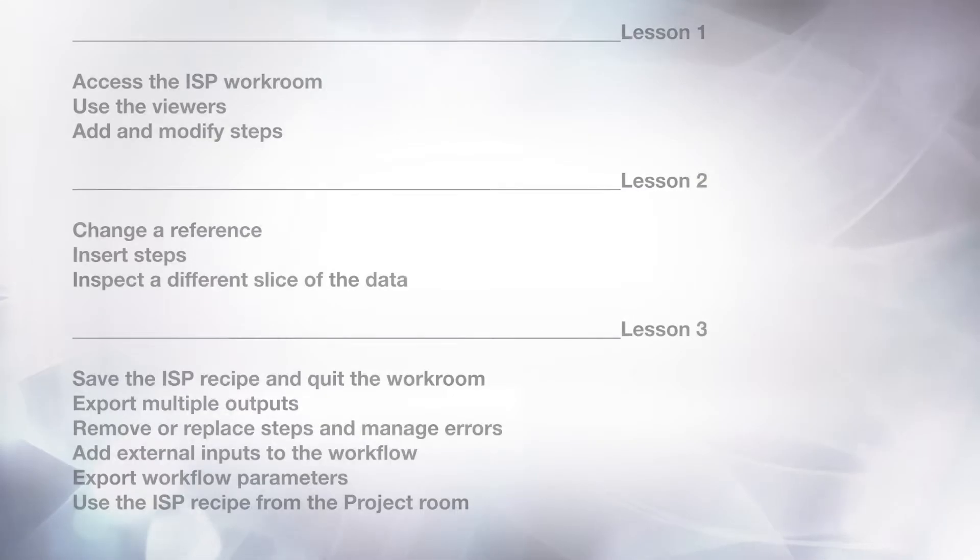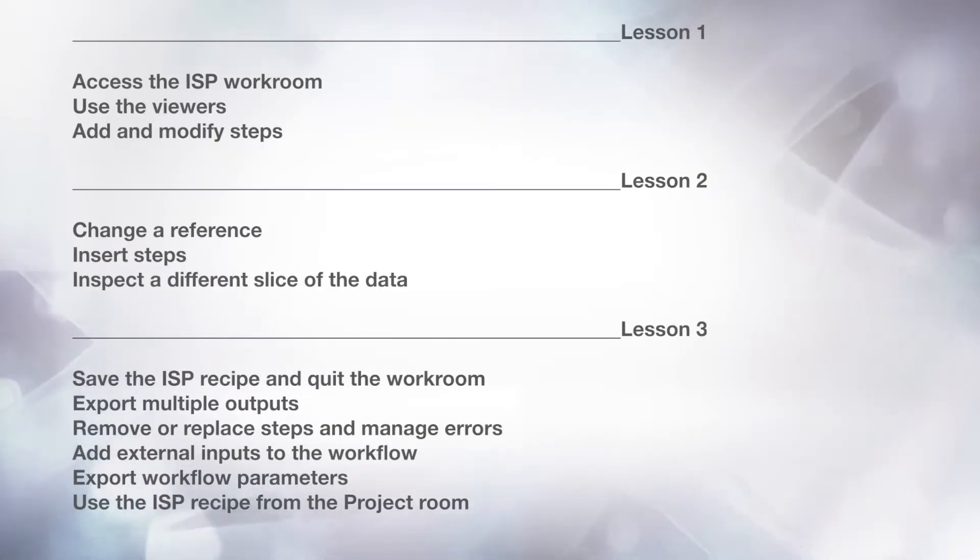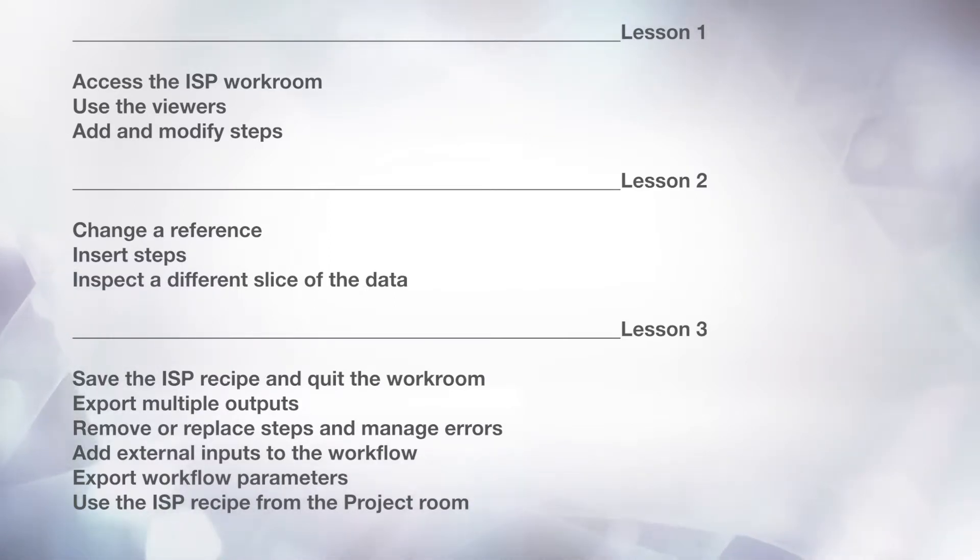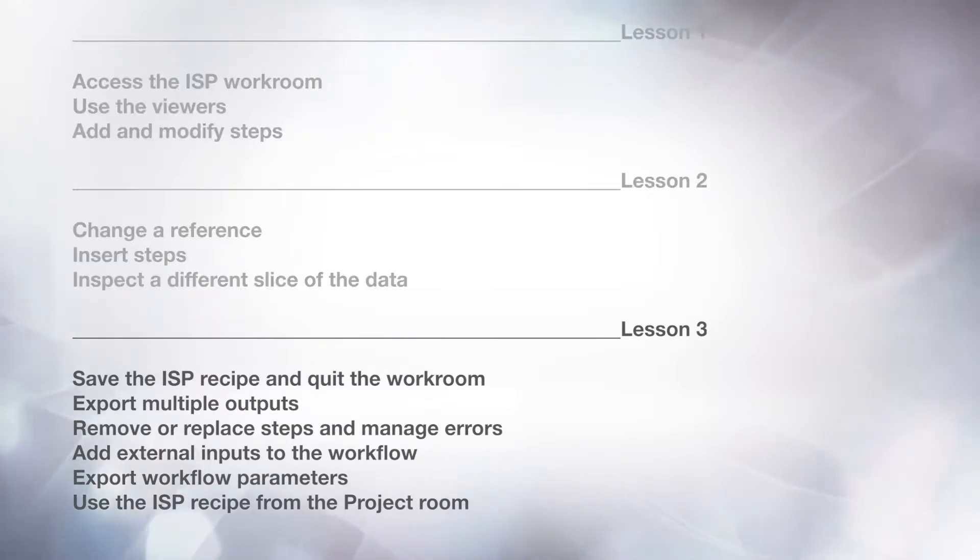In the first two lessons, you should have learned how to access the workroom, use the viewers, add and modify steps, change the reference, insert steps, and inspect a different slice of the data.